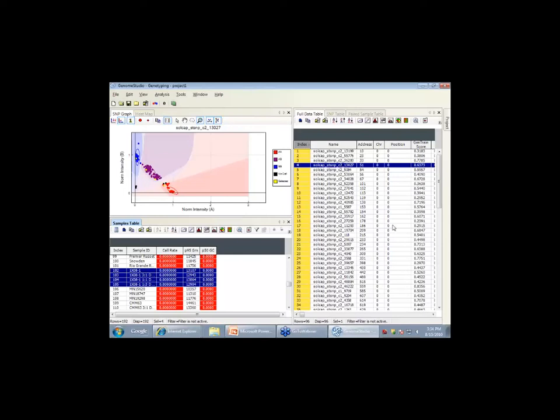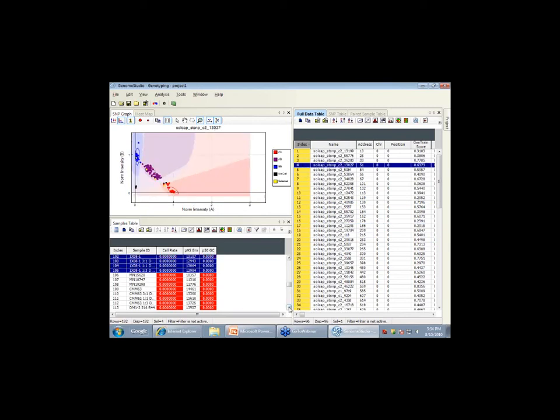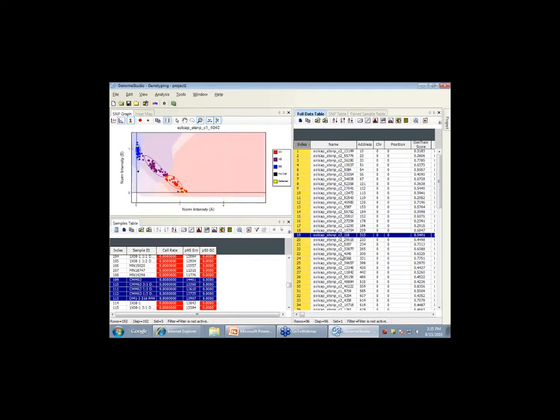So you can click through markers. This isn't going to work for all markers. So here in this case, DM times XO8 is not polymorphic when you click marker number 13. So it doesn't work for all the markers. But you'll see the doses here, so we can click the different markers. If you highlight 109 to 113, you'll get different doses. This one doesn't seem to separate out as well as the other one. But you can walk through and you start defining doses, and so on with spike.